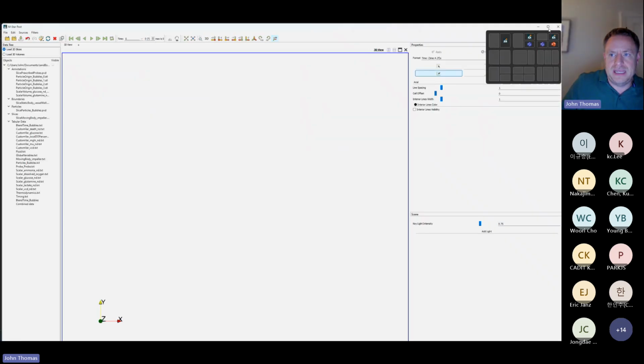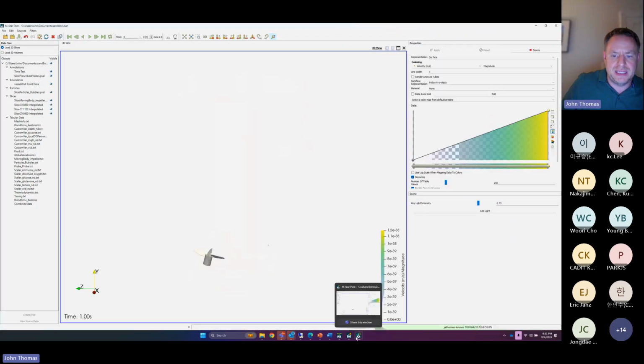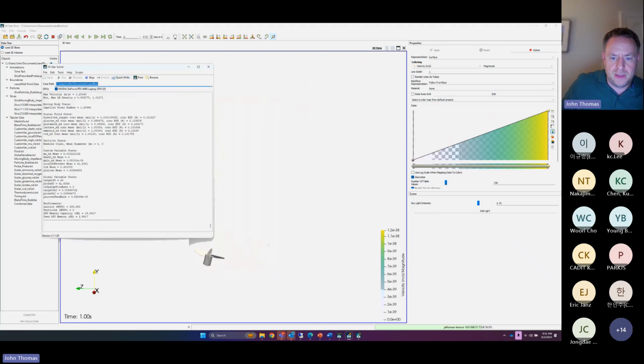Now this is again our single-use bioreactor, 2,000 liters, with the glucose control. Not much to see yet, so maybe I'll go to the code and do a quick write so I can see what kind of data I have coming out of the system. But this is what we got.